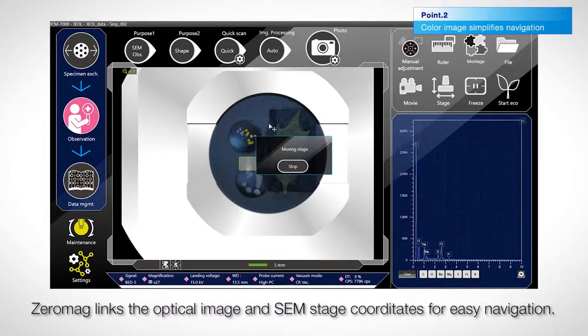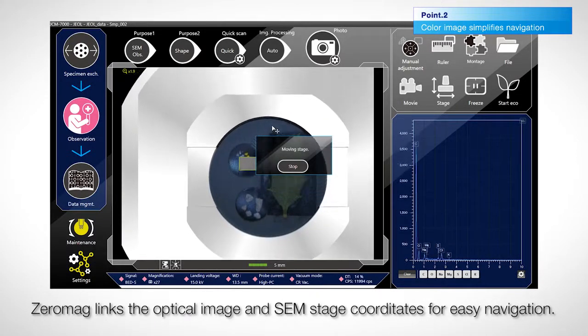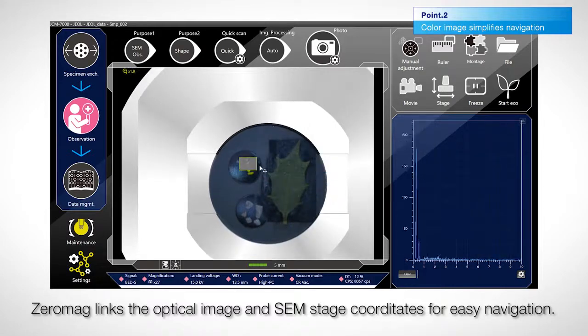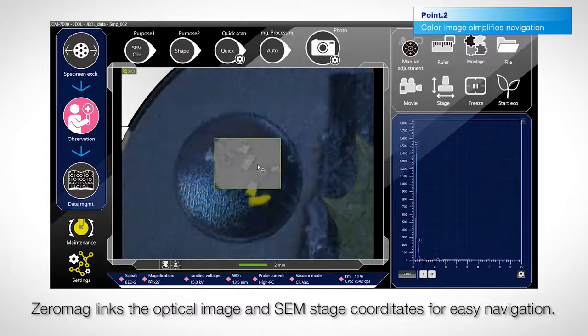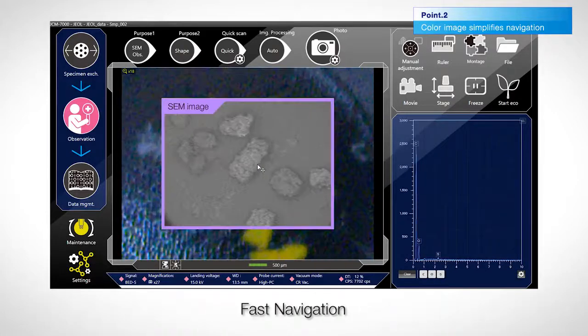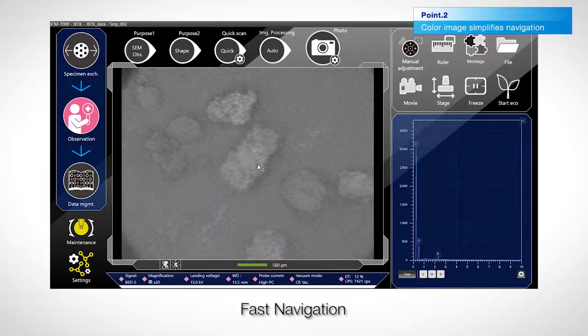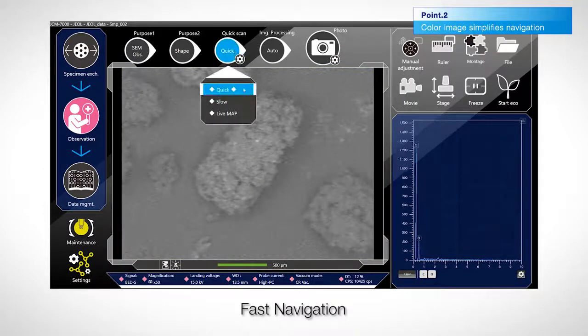Select anywhere on the image to automatically move to that location. Increase the magnification to transition seamlessly from the optical image to the live SEM image. Anyone can quickly find the field of view by selecting the target position from the optical image.